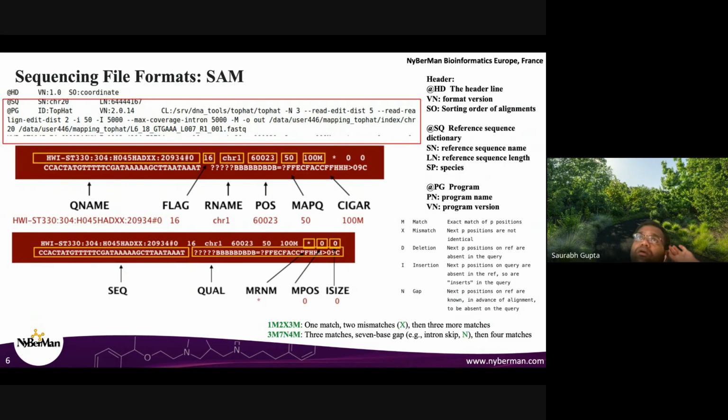Okay, good. So now we have aligned the data, right? Now I'll touch upon another file format. See what we have done till now: we processed the data, and we know where this particular data is aligned to. Next, what are we ultimately trying to quantify? Ultimately we are trying to quantify genes, that is, which gene has how many reads. We do not have that information yet. We only know which chromosome, which position, and which read is aligned there. Now, how do we do that?